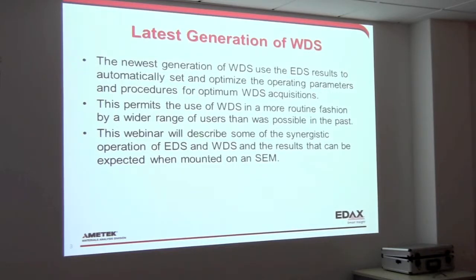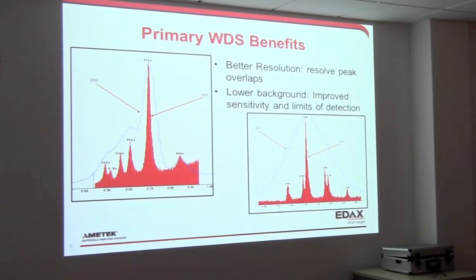So I'll just talk about what has gone into the TEAM software, as you've seen some presentations on that today, to show what the cooperation and handshaking is between the EDS and WDS, to give that synergy between the techniques to promote the analysis of the data in the systems.